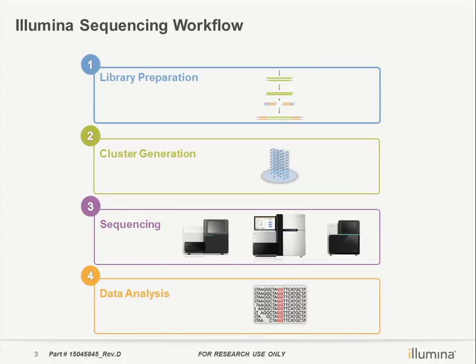The output file after the sequencing is the base call files. Unlike the MiSeq, which has an inbuilt secondary analysis software called MiSeq Reporter, where the output file you get is the FastQ files, the NextSeq is more similar to the HiSeq system. What you get is the base call files, the BCL files, and you have to use software to convert the base call files to FastQ files.